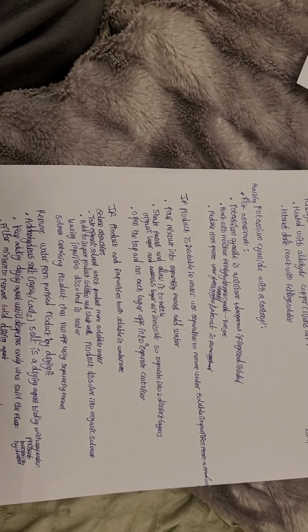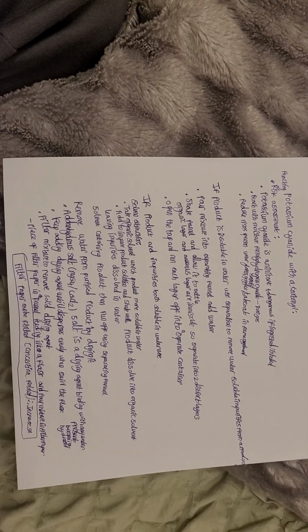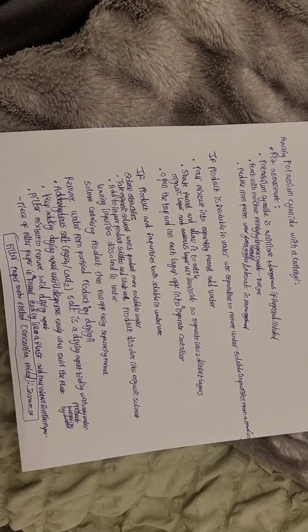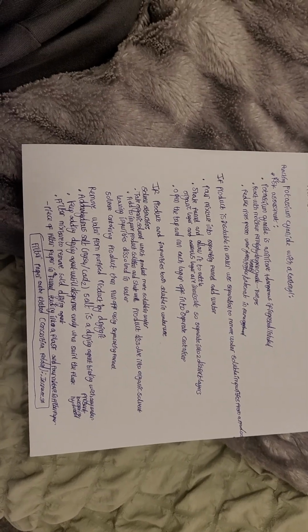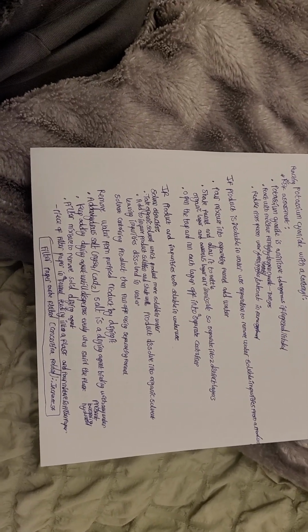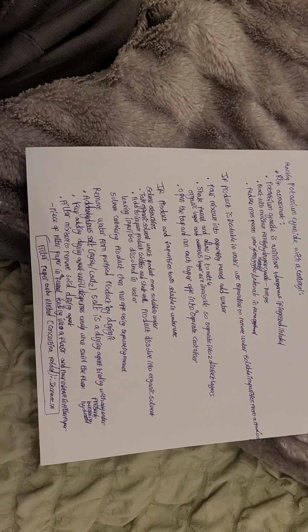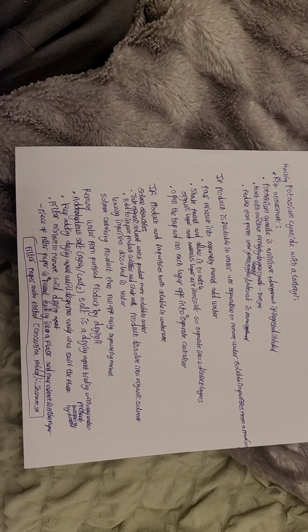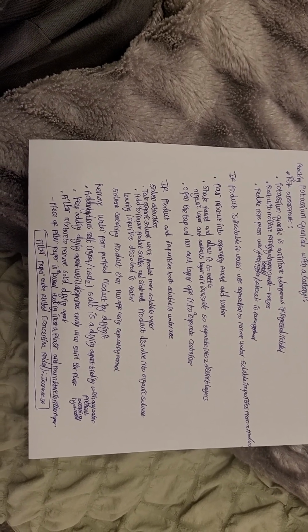If the product and impurities are both soluble in water, you want to use something called solvent extraction. So we want to take an organic solvent which the product is more soluble in than water, add it to the impure product solution and shake well. The product dissolves into the organic solvent, leaving the impurities dissolved in water. The solvent containing the product is then run off using a separating funnel.